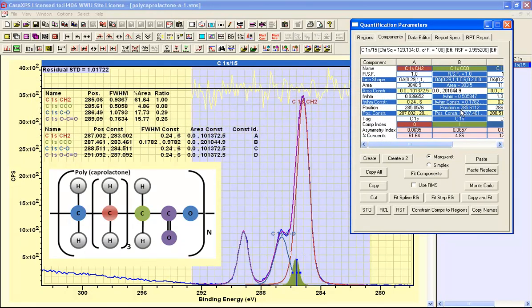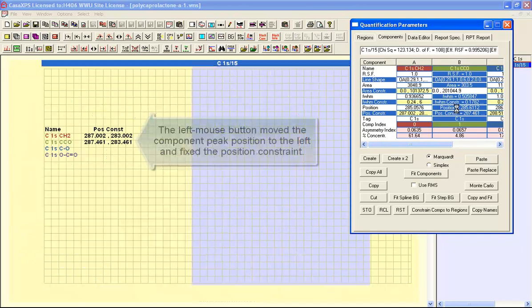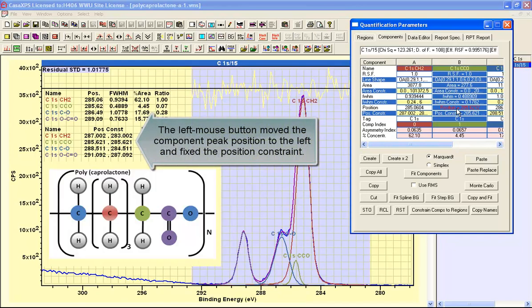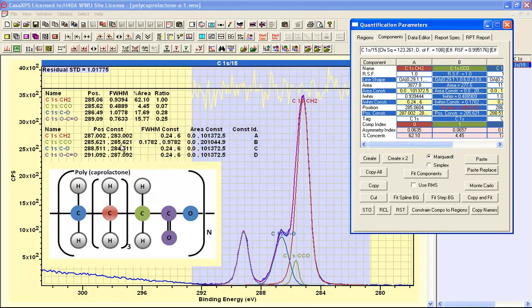So I hold the shift key down, and using the left mouse button, I click. The position turns red because I've now fixed this. You can see this because the interval is now identical to the value.